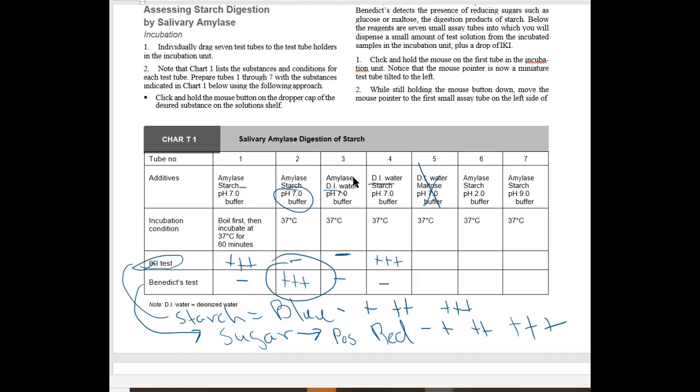So here we've got enzyme, substrate, pH of 2. So this is 5 whole pH units below the pH at which amylase is usually functioning. So this is not going to be good for the amylase. I would say, if I remember how this works out, most of the starch is left over. And you only get a very little bit of sugar production because most of the amylase is denatured, or all of it is denatured to the point where it's not very functional.